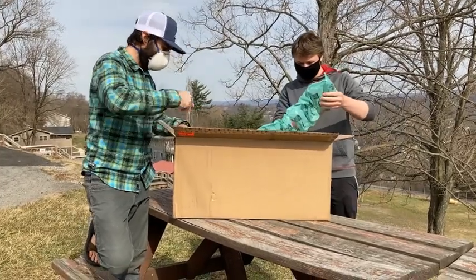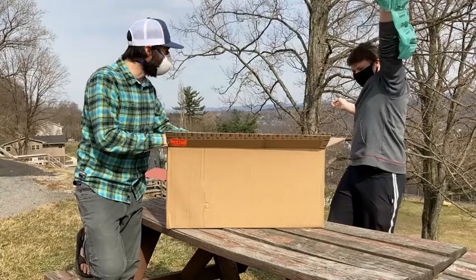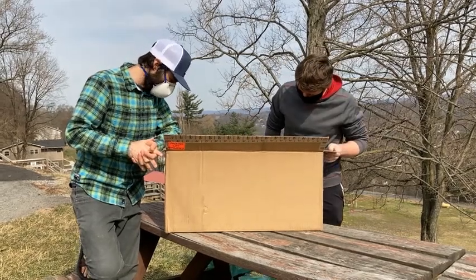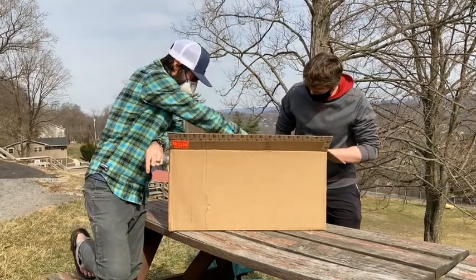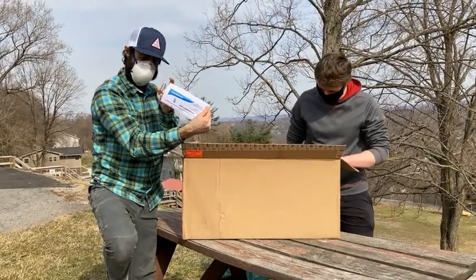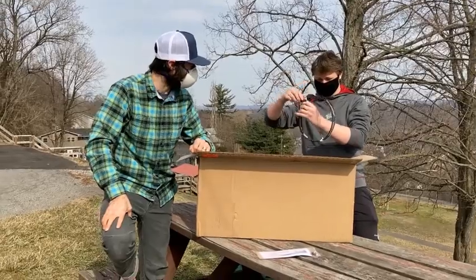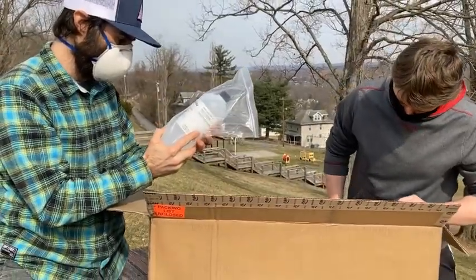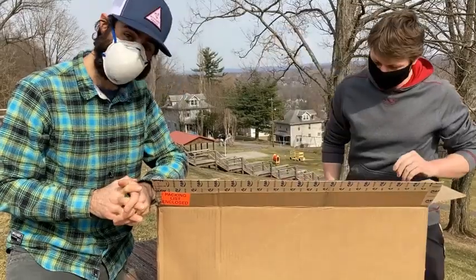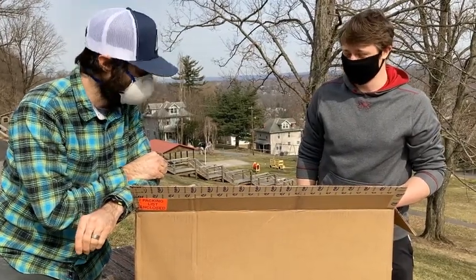Let's pull out that bubble wrap and see what we got. Oh, that is beautiful! So all this precious wrapping — it looks like we got all kinds of goodies in here. I'm going to try to start with the least exciting thing... everything in here looks exciting to me. We'll figure out what to do with that later. A cord — excellent, that is a great cord. Nitrate standard. More calibration solutions — excellent, this is so exciting! And here we have two more boxes: a smaller one and a larger one.